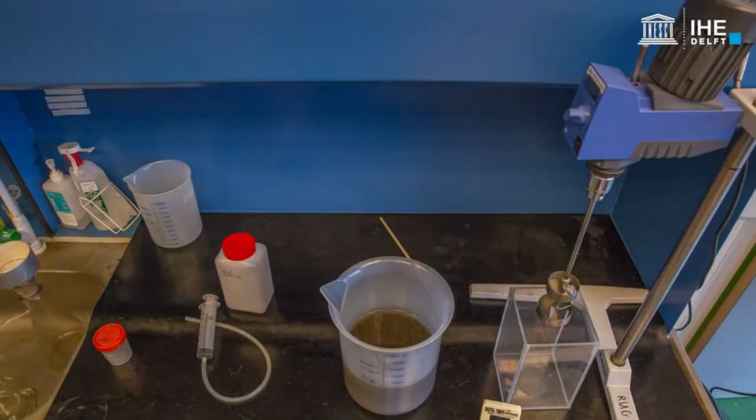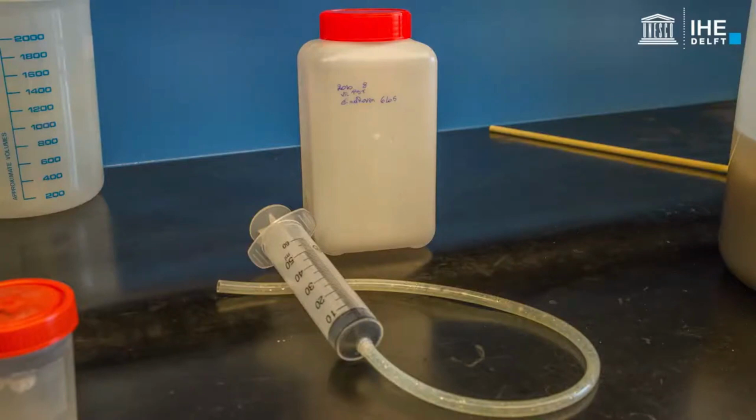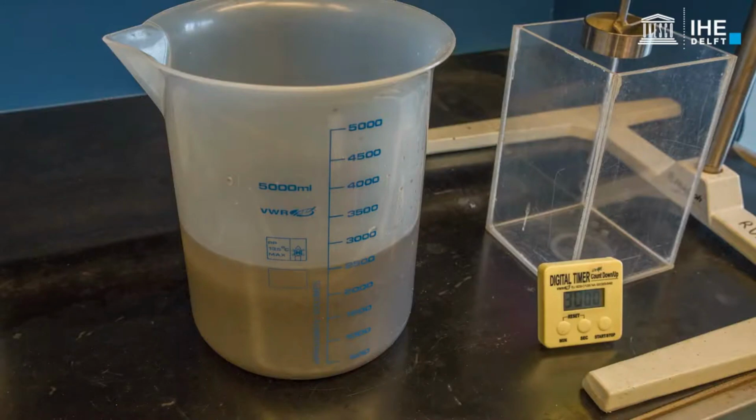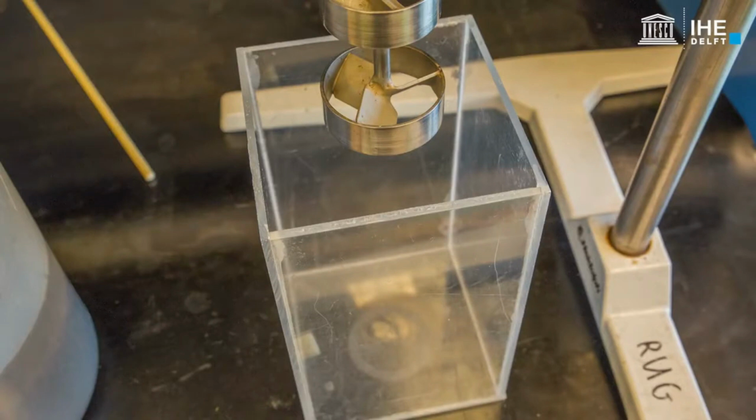An FSS test quantifies the flocculation potential of a sludge sample by measuring the concentration in the supernatant after 30 minutes of settling under ideal flocculation conditions. Overview of equipment needed. Flocculation is maximised by mixing the sample for 30 minutes prior to settling. Settling is performed in an ideal settling device.